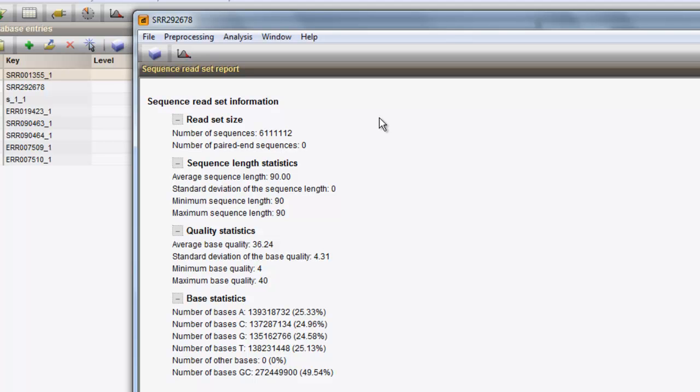From these preliminary statistics, and knowing that this sample was derived from E. coli, we can already be confident on the run quality, as the GC content of E. coli is known to vary around 50.5%.